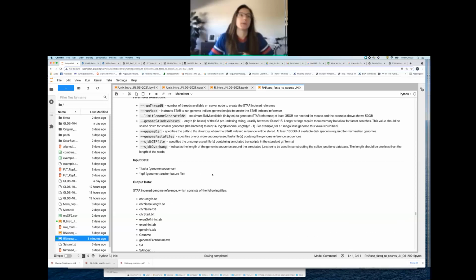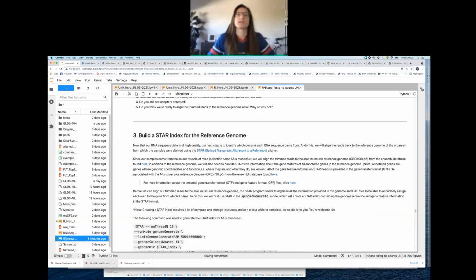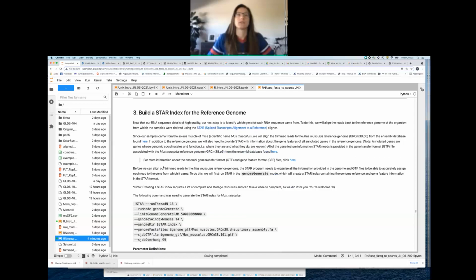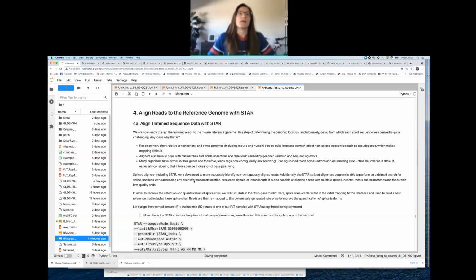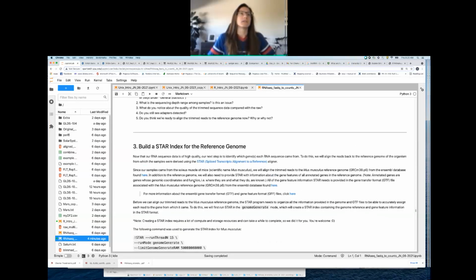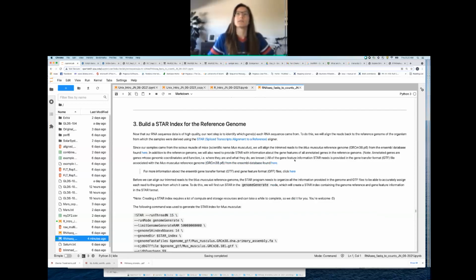And then, of course, I did promise you guys I'd show you this. You can go to the GTF files, my STAR. That's the Ensembl database. I think it's right here. Yeah, so you can go to the splice aligner here.